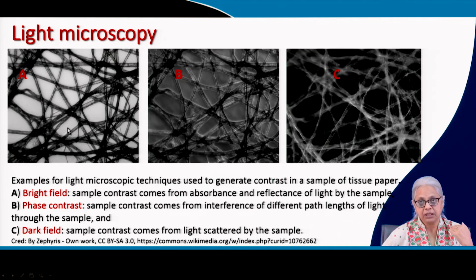So whatever color you see is the reflected color. And scattered light is basically not going to be of much use except in dark field microscopy. That is where you're looking at the scattered light, or the light reflected from the sides of the specimen.